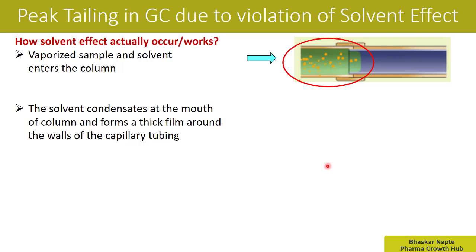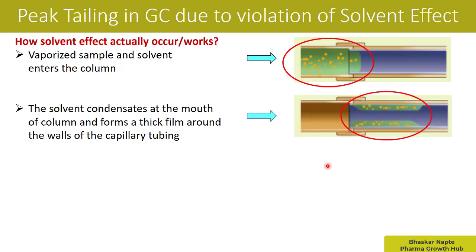The solvent condenses at the mouth of the column and forms a thick film around the walls of the capillary tubing. Whatever solvent is in vapor form, as it reaches the column, the column temperature is not sufficient to maintain the solvent in vaporized form. Because of this lower column temperature, the solvent starts condensing at the very beginning of the column — it condenses along with the analytes and forms a thick film around the wall of the capillary tubing, as shown in the diagram.